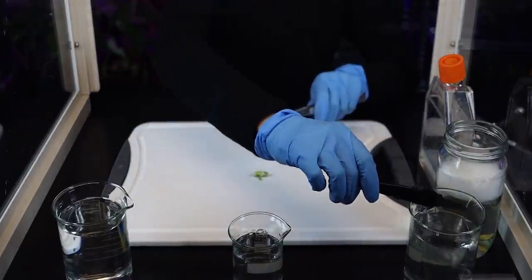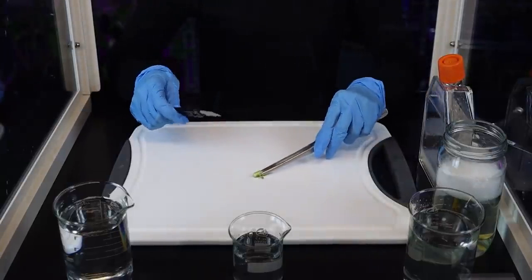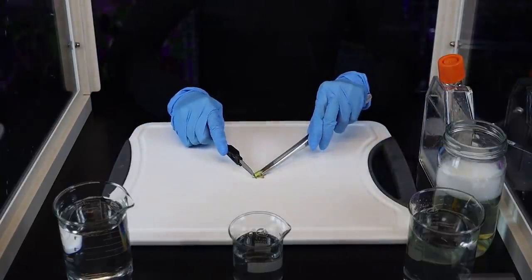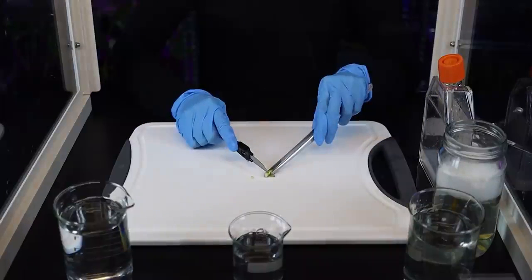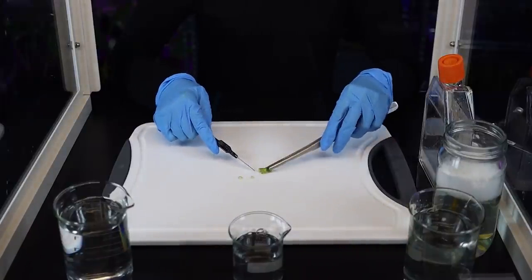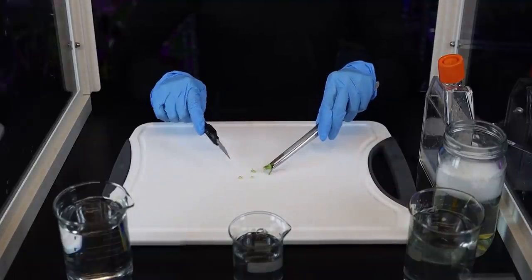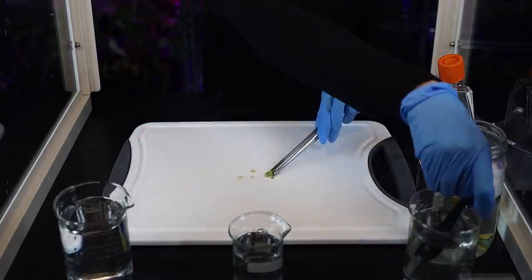I'm placing it onto the chopping board and I'm trimming off either end of the node. Now I'm doing this because basically the alcohol and the bleach will have probably killed off all of the outer tissue on this node. And in order for tissue culture to work, I need fresh, sterile tissue. So cutting off either end of the node is basically exposing that tissue.